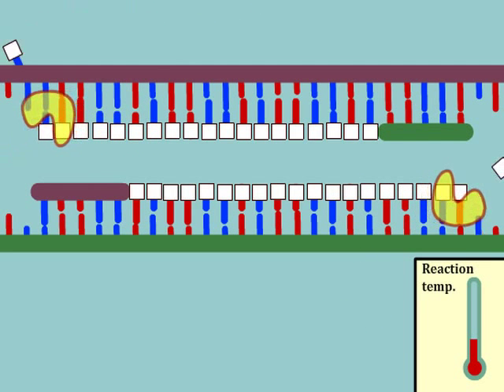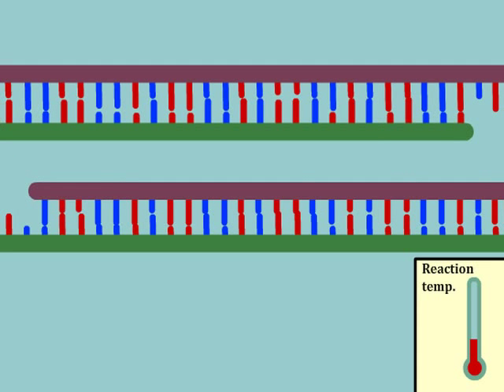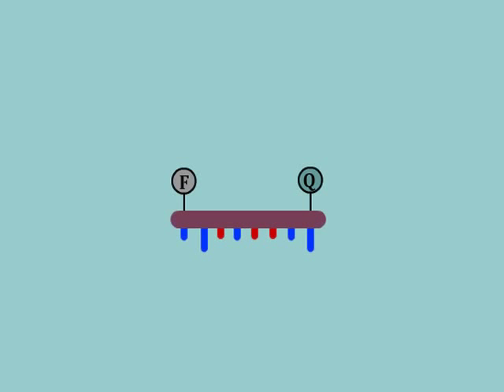If you have any confusion about this basic process, it might be a good idea to review the program on basic PCR once again. To detect the generation of new amplicons in real time, the PCR reaction requires an additional ingredient, a single-stranded DNA probe designed to hybridize to the part of the DNA sequence synthesized between the two primers.